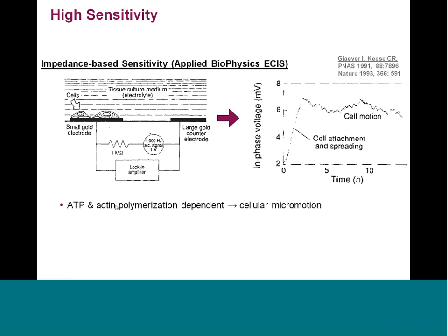They could characterize their resolution of cellular micromotion and found that they were detecting changes in cell diameter on the order of 1 nanometer. To put that in perspective, a comparable assay for cellular morphology changes in real time on a live cell done by light microscopy would have resolution on the order of 250 nanometers. So this is orders of magnitude more sensitive. To put it in the perspective of a cell bilayer is about 3 nanometers. So this is done at 1 nanometer in diameter mode.